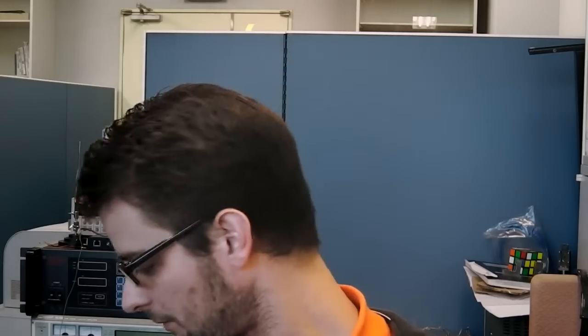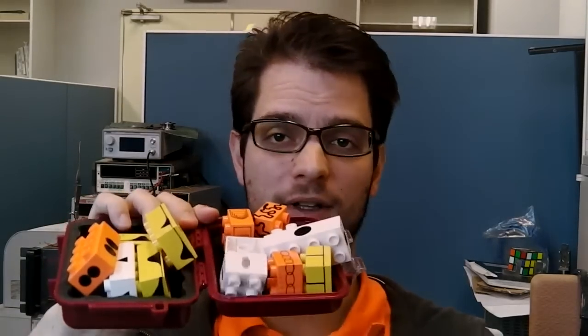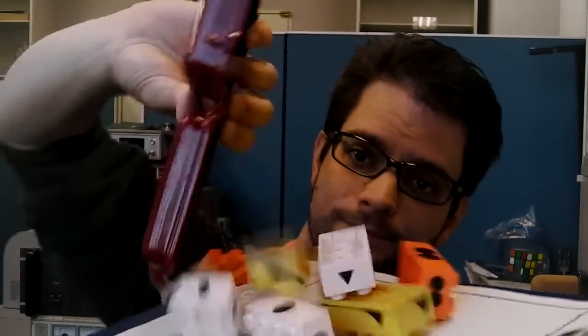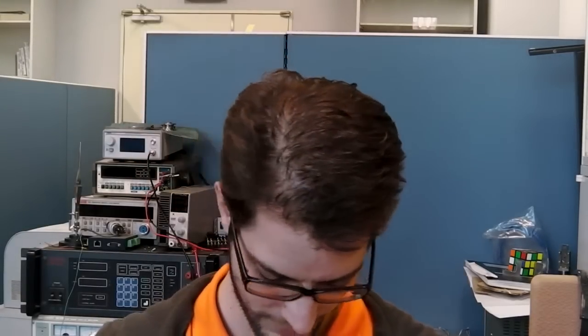and to try and describe your data perfectly is what is most frustrating about the classical toolbox. So sometimes people get frustrated because they don't quite know how to construct their classical model, and they look at their entire toolbox and they look at their scattering pattern and they just try to apply the entire toolbox to the scattering pattern. I need to clean that up now. These people might end up with a model that eventually does fit their data.